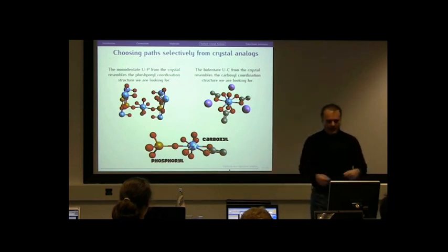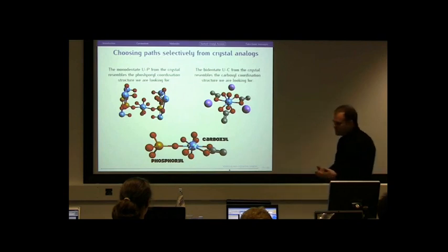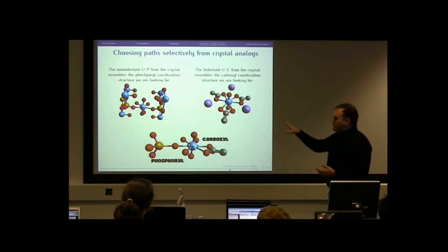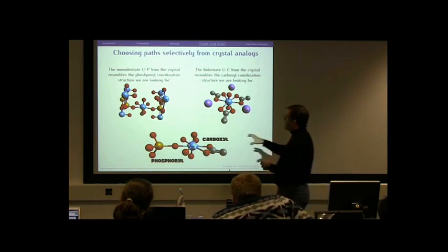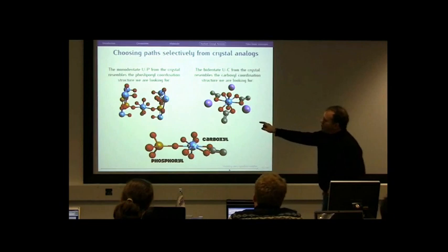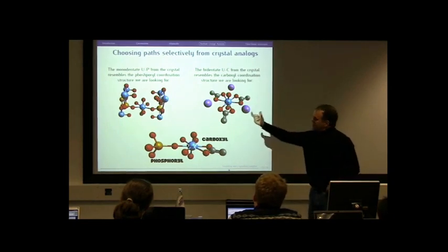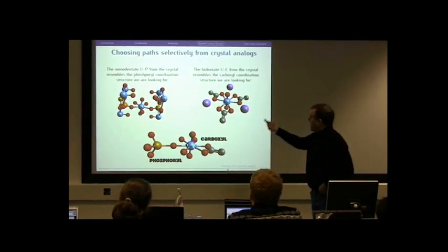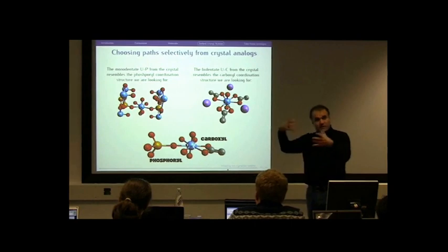And so she was able to show the pH dependence of bonding to phosphoryl and carboxyl ligands, not because she had some magic prior knowledge of what this thing looks like, but because she found crystal structures that had little units that she could snip out and put into the fit on the uranyl attached to goo.